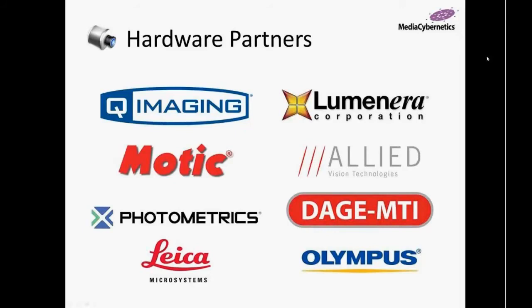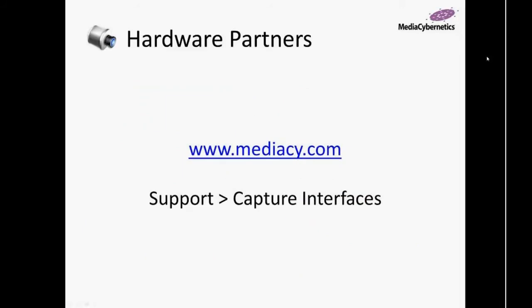If you're interested in the full list, you can simply go to www.mediacy.com, look under our support options, and look at capture interfaces, and you'll see all of the available capture interfaces there. One thing about Media Cybernetics is we want to make sure we provide you with excellent support, and we're always providing you with all the necessary resources to get the job done. All of these capture drivers are free of charge. We won't charge you anything extra for as many cameras as you need to support.